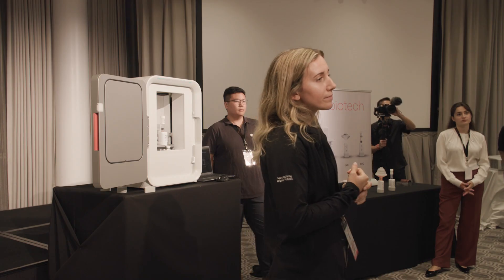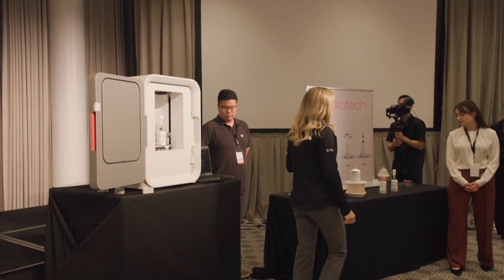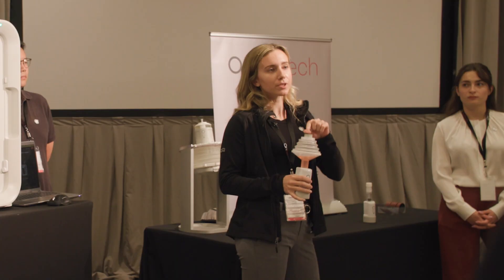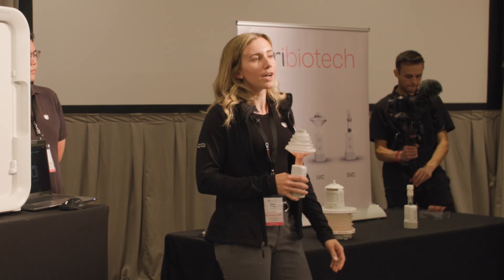Can you speak a little bit about loading and unloading cells within the culture process? Yeah, so we load the cells using the large volume consumable. We actually have sterile weldable tubing under this top cap and also coming out of the base of the bioreactor.